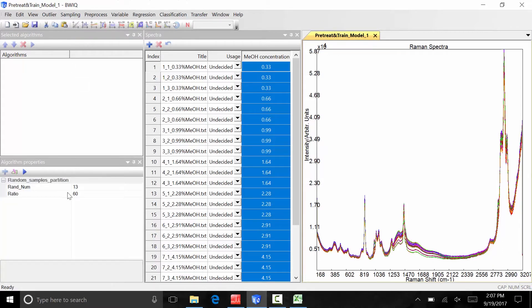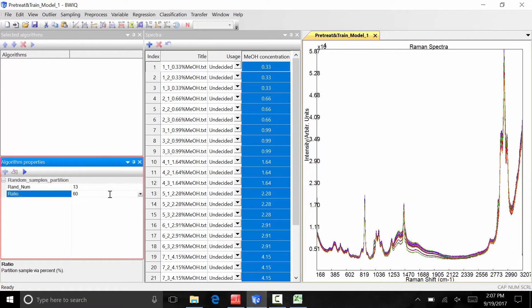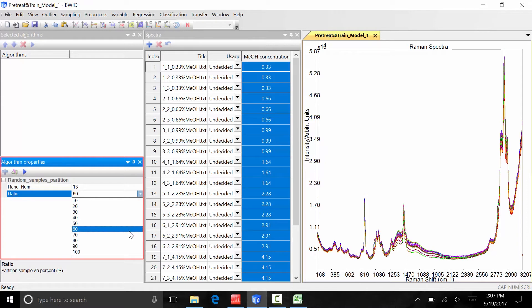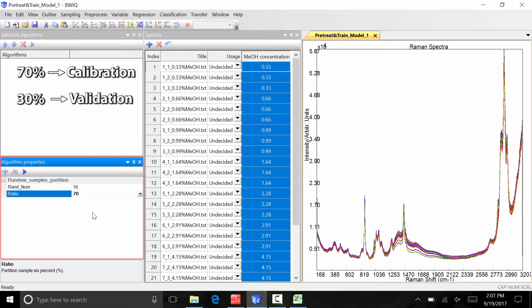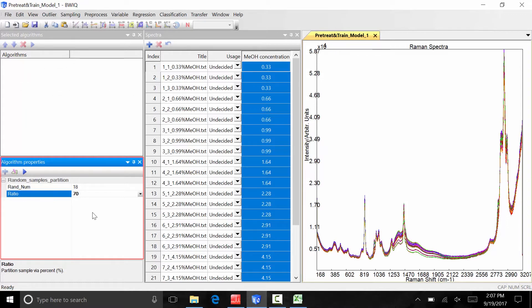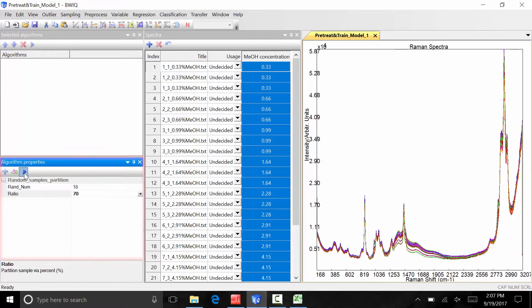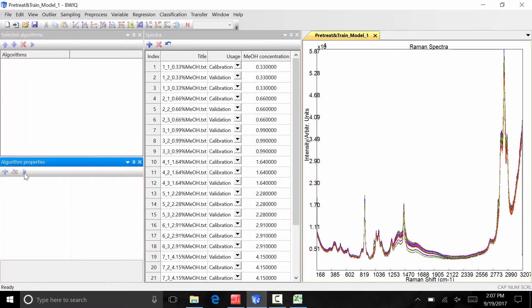The parameters for the random sampling algorithm will appear in the algorithm properties panel. In the algorithm properties panel, click ratio and select 70 from the drop-down. This means we will designate 70% of the spectra as calibration files and the other 30% as validation files. To apply this sampling algorithm to the data, click the blue execute button in the algorithm properties window. The usage column in the spectra window now shows which spectra are designated as calibration samples and which are validation samples.